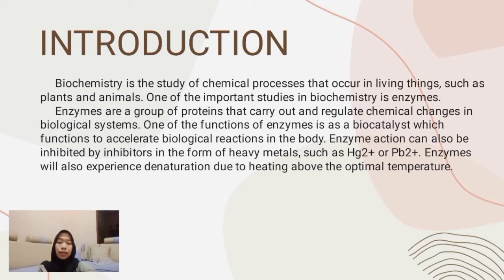The first is the introduction. Biochemistry is the study of chemical processes that occur in plants, animals, and microorganisms, as well as the changes they undergo during development and life. Biochemistry was first introduced in 1911 by Carl Neuberg, who was a chemist from Germany. One of the exciting studies in biochemistry is about enzymes.